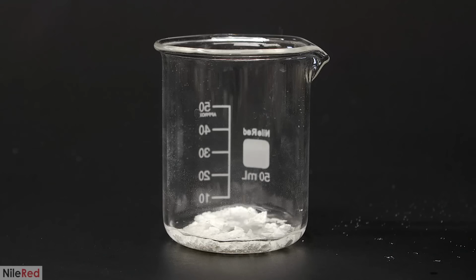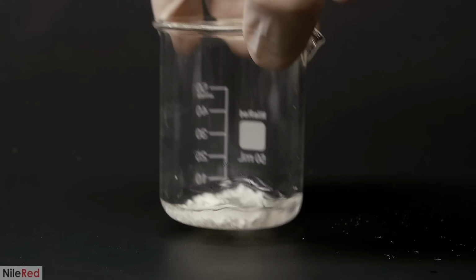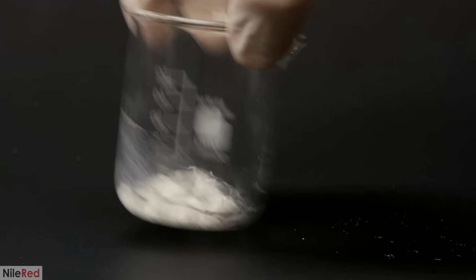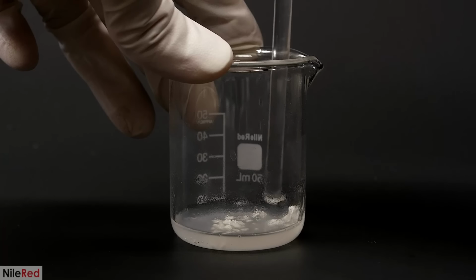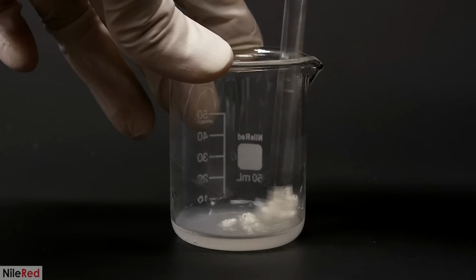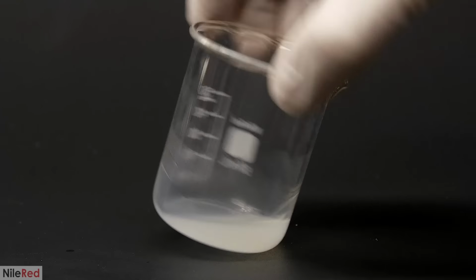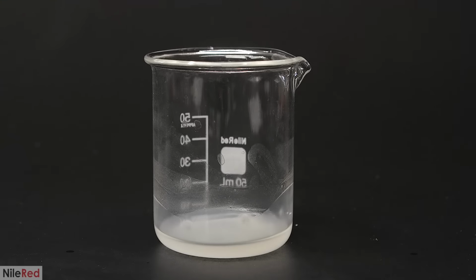I threw a random amount that I felt was enough into a beaker, and then I shot in some acetone. The quantities here aren't super important, and I'm just trying to make a really concentrated solution. It took quite a bit of stirring and something like 5 minutes, but eventually everything disappeared. I could probably dissolve more, especially if I warmed things up, but I figured this was good enough.